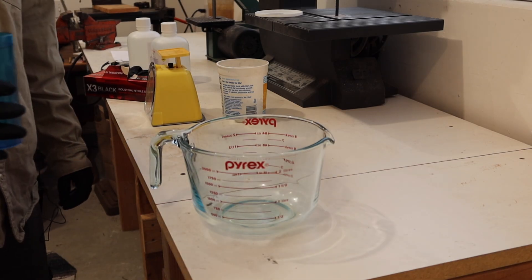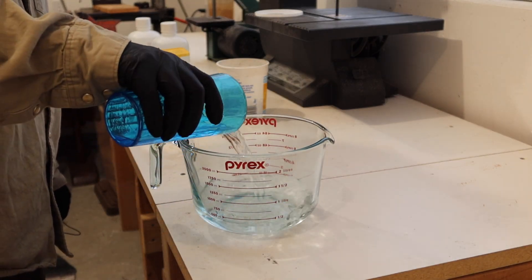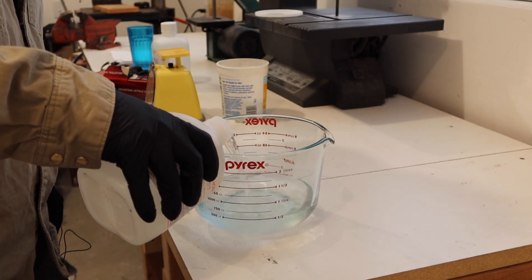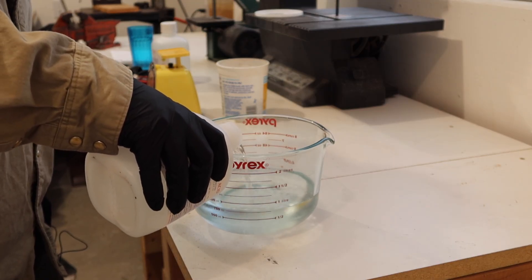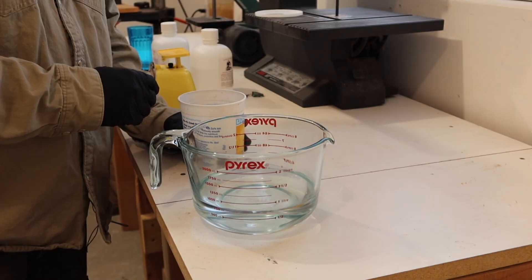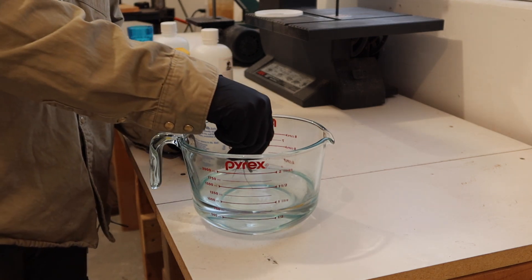To get this reaction started I'm going to add about half distilled water and half nitric acid to a container that I trust isn't going to randomly break on me. Next I'm going to slowly start adding some silver to it, and you can see it start reacting right away.